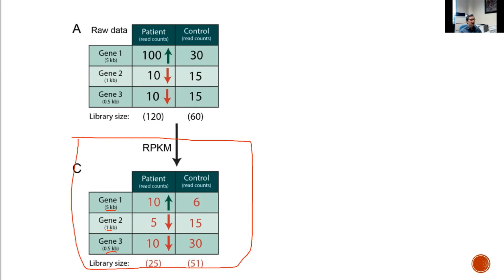It is not applicable to single-cell RNA-seq because in single-cell RNA-seq, the detection method is not sensitive to the length of the gene. They only use hybridization of the 3' poly A tail to the 10X Genomics GEM barcode.